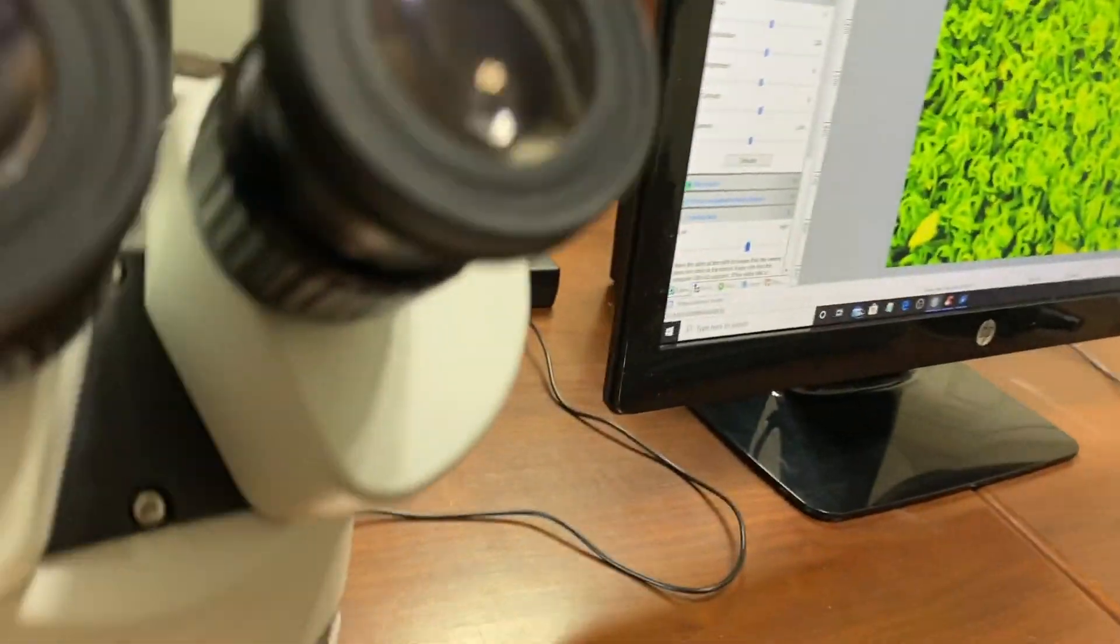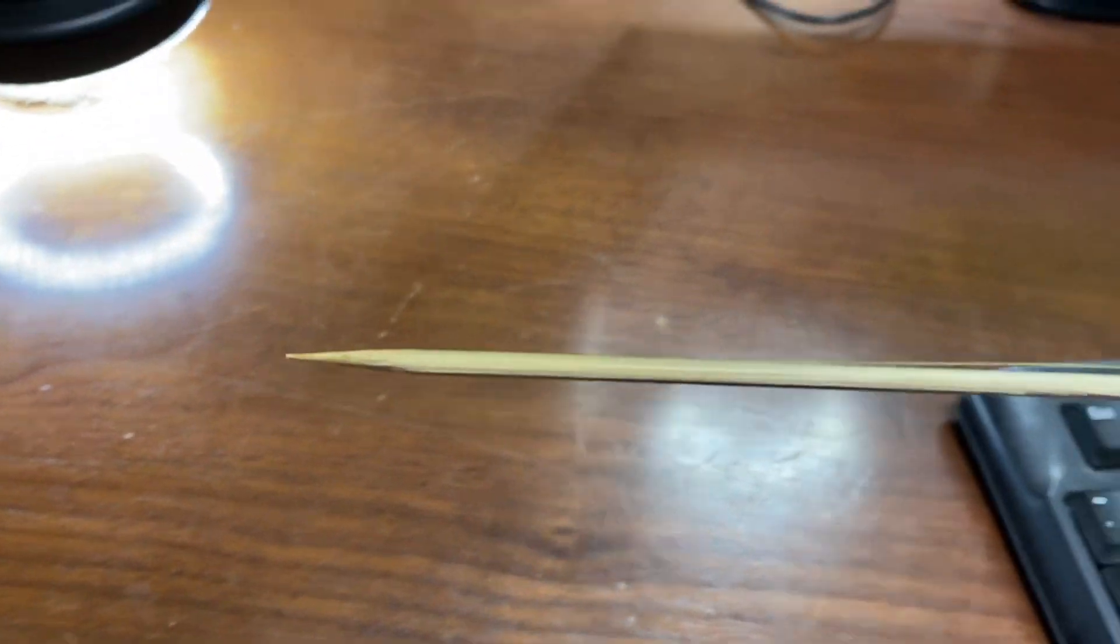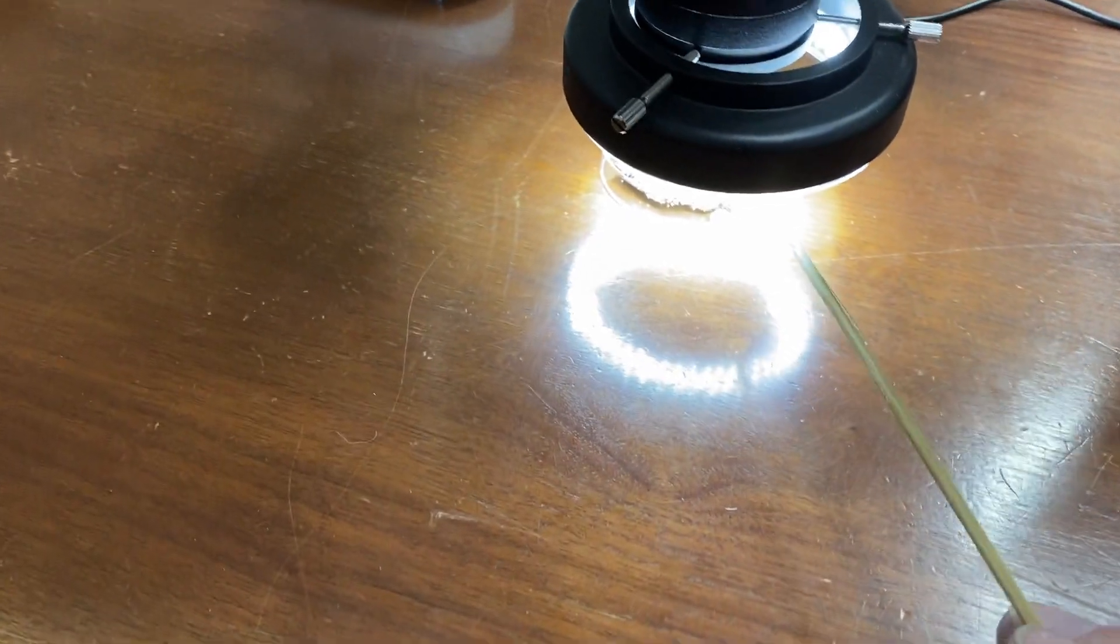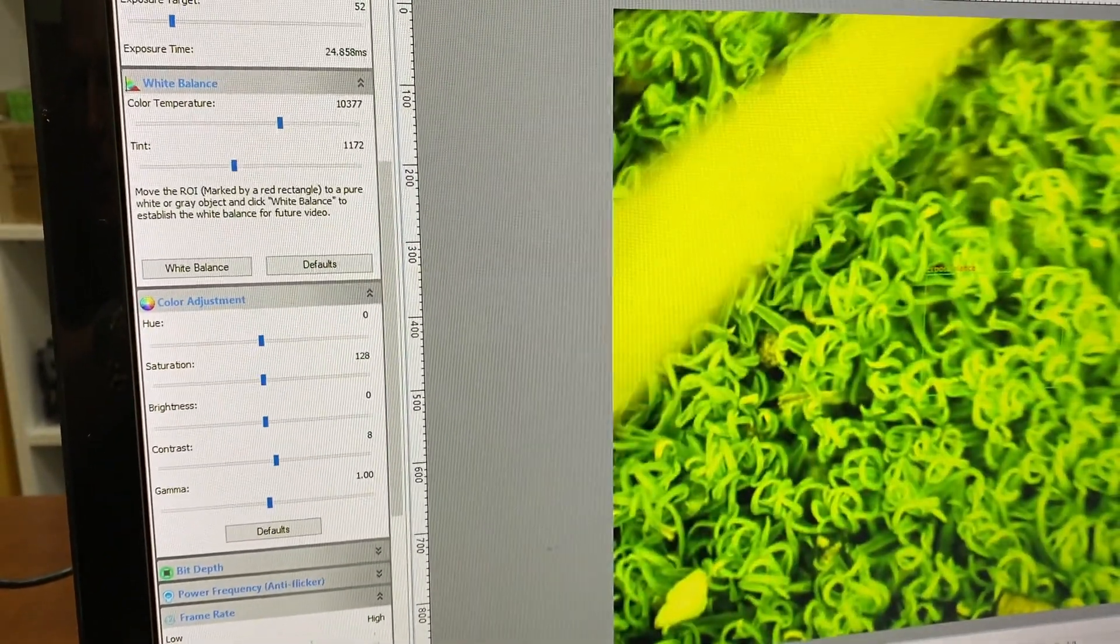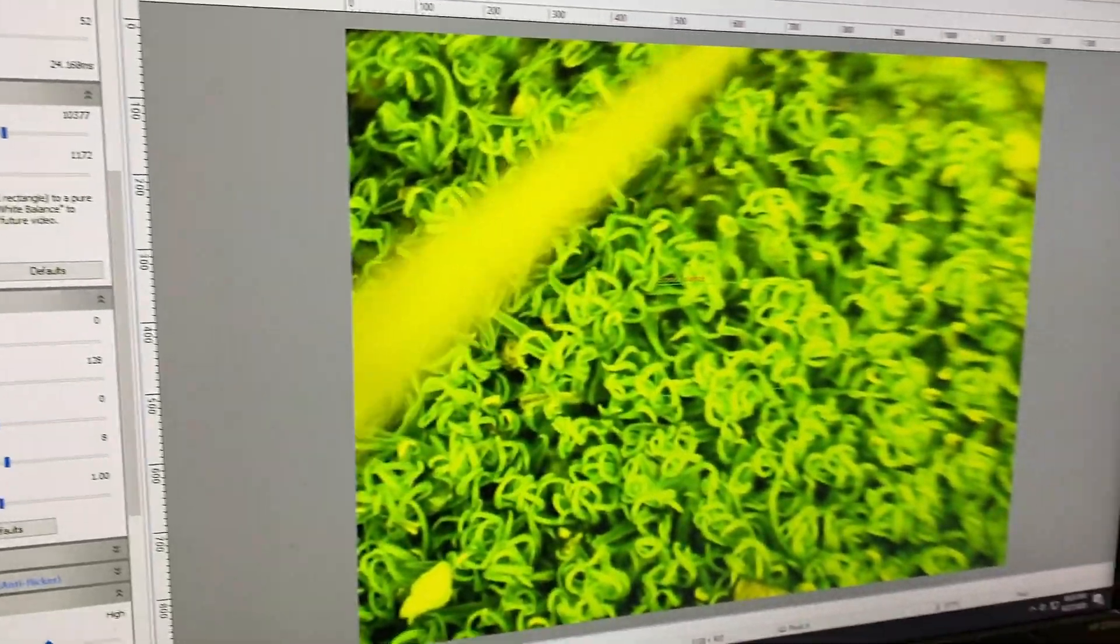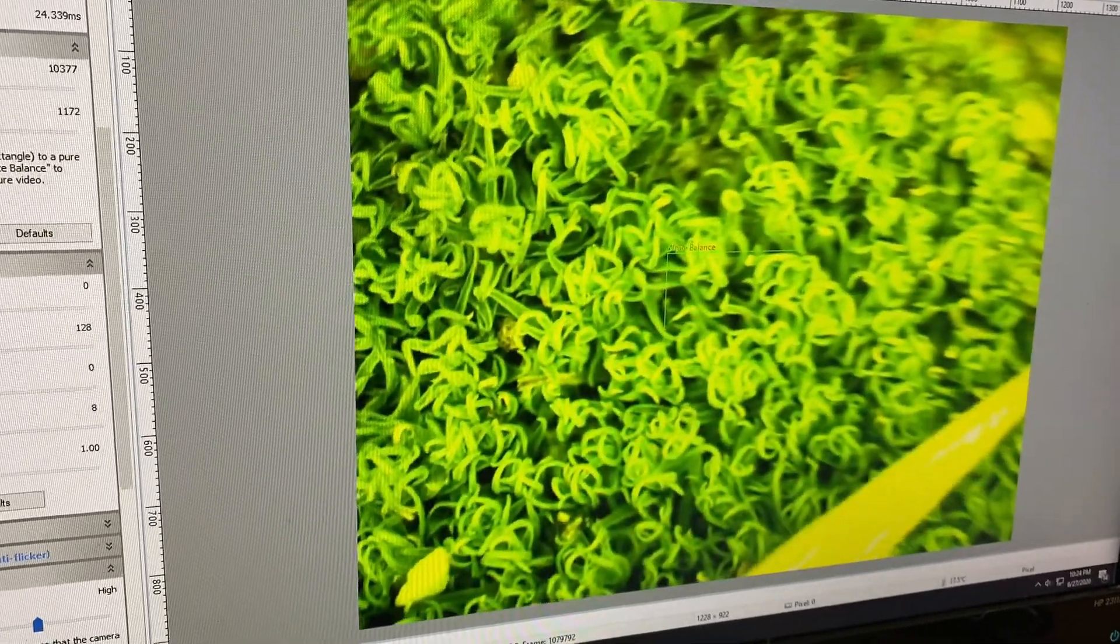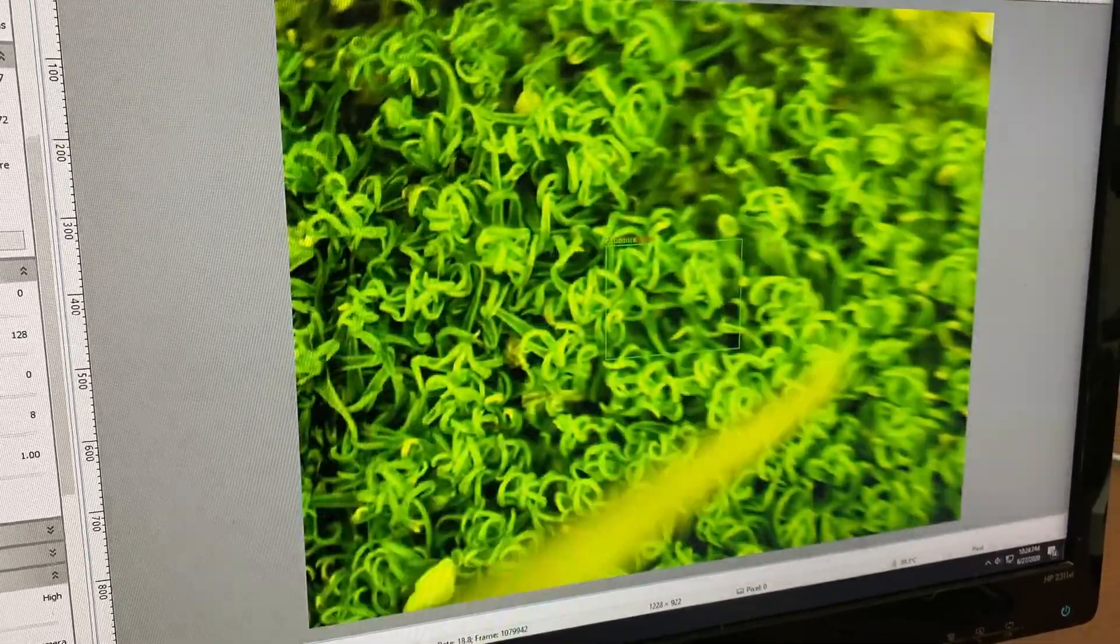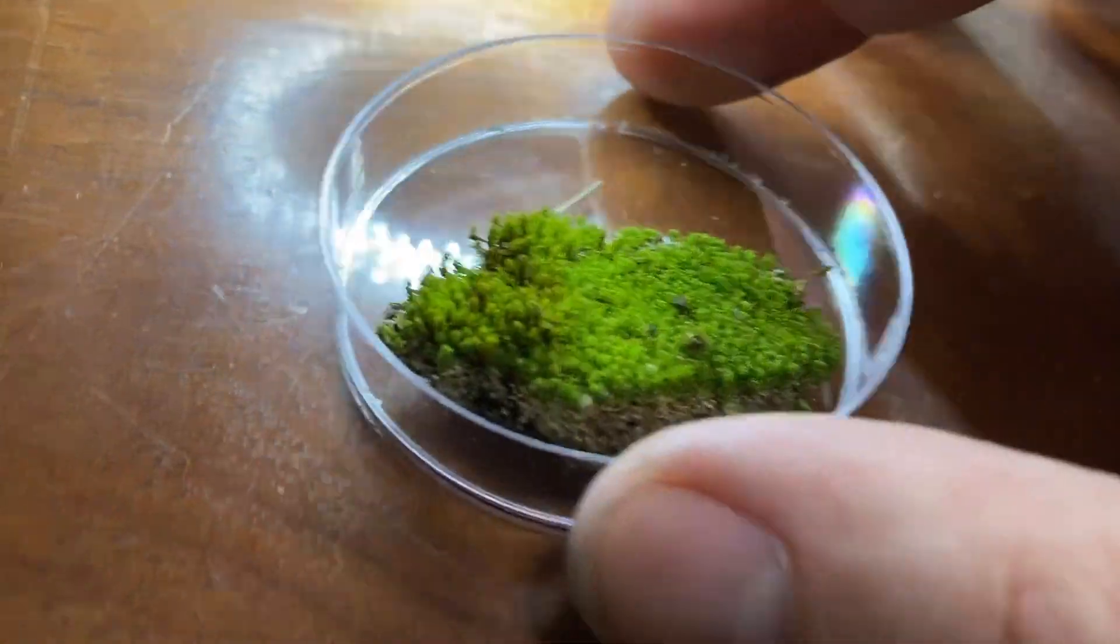I'm going to use a stick and just show you what. Here's a bamboo skewer that I have. And that kind of gives you an idea of size there with my finger. So when we put it under the microscope here, you can see over here the size. Right there. Oh, I'm moving it too much. Alright, so that's what the moss looks like under the microscope.